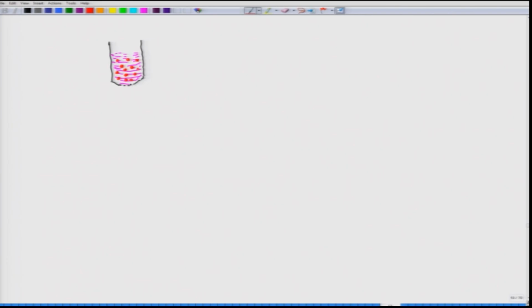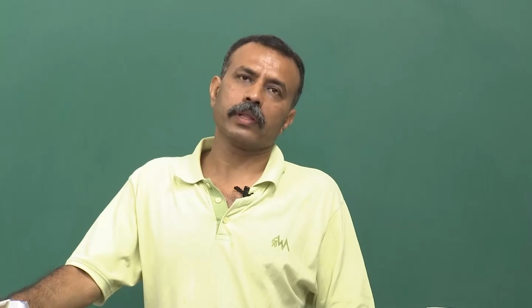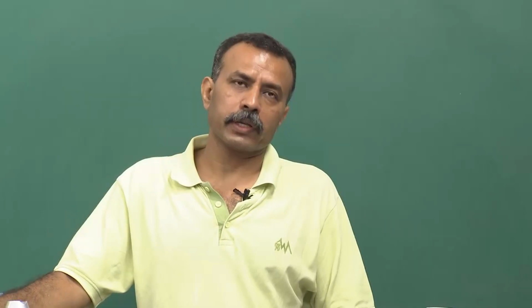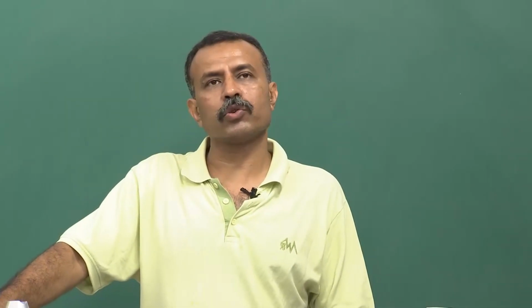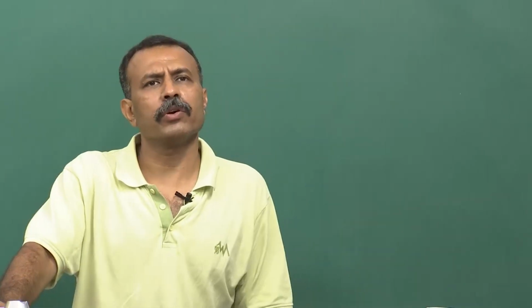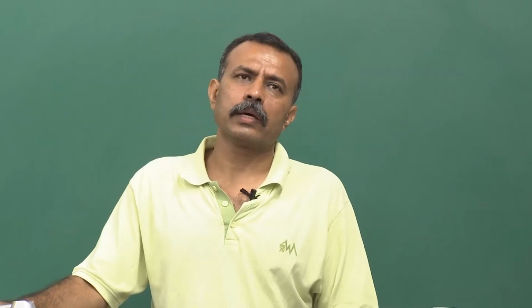Now, what you do, you take these, and beforehand you have to prepare your cover slips or substrate. In the last class we talked about how to prepare substrate. You have to prepare the cover slips and coat them with the substrate of your choice. So, in this case for hippocampal neuron, one of the favorite choices is poly D lysine.